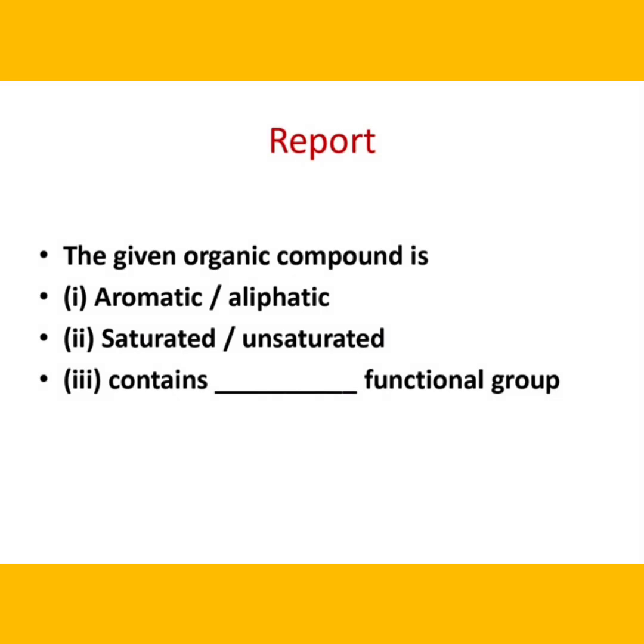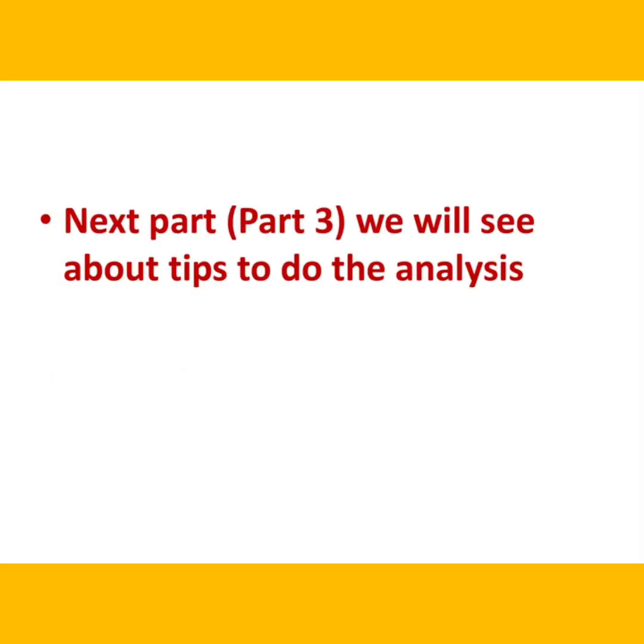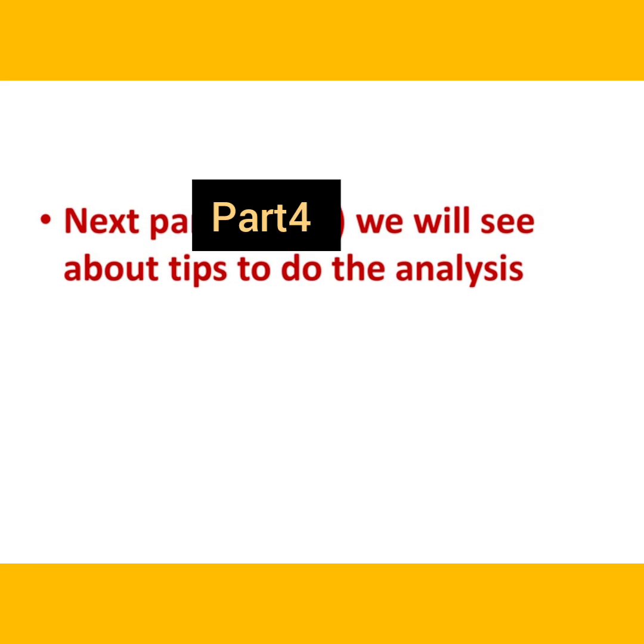So the next part, in part 4 we will see how to do the preliminary test. To sum up, in part 3 we have seen the 7 headings for preliminary test and 7 tests which are for functional groups. Thank you.